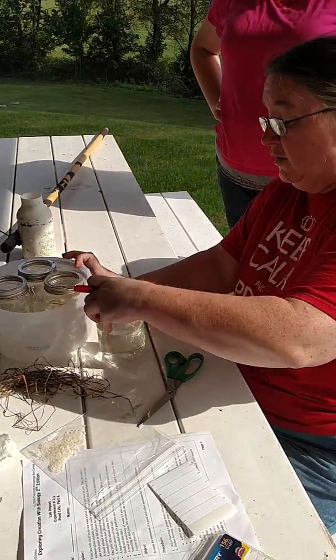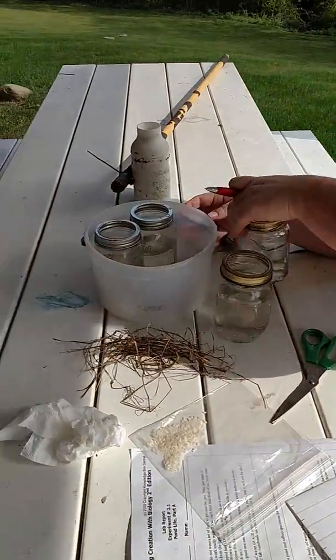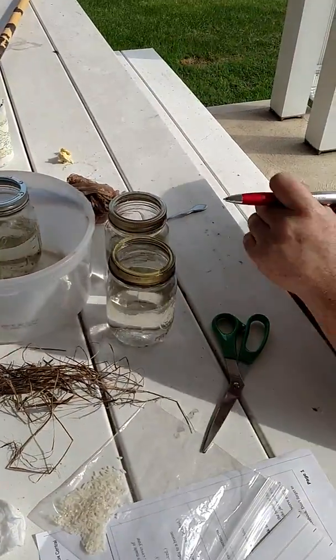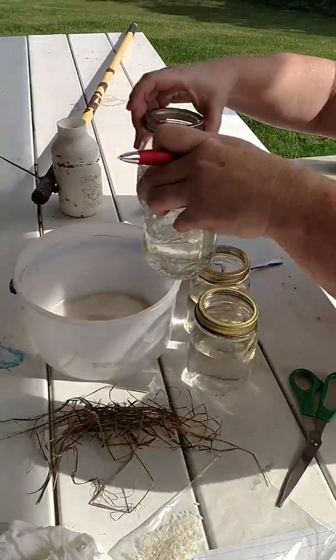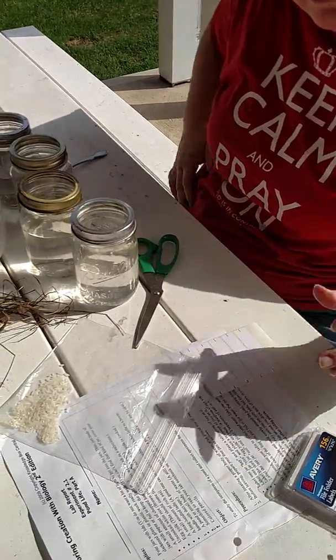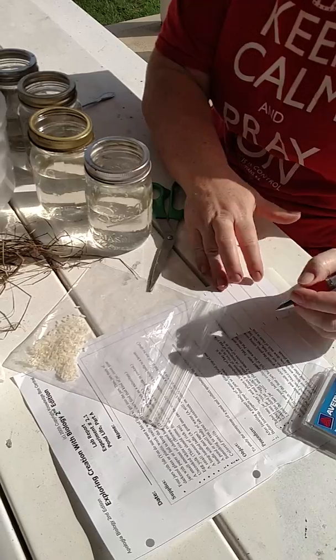We've got our collected pond water. We have four jars, all pretty well full. I'm going to pull any extra garbage that I can out of it. Actually pretty good from the outside. And then you want to label a jar.